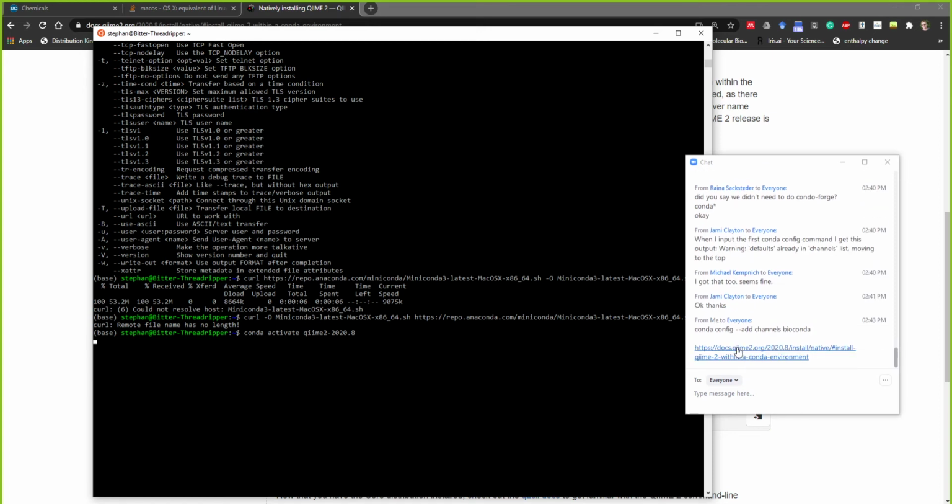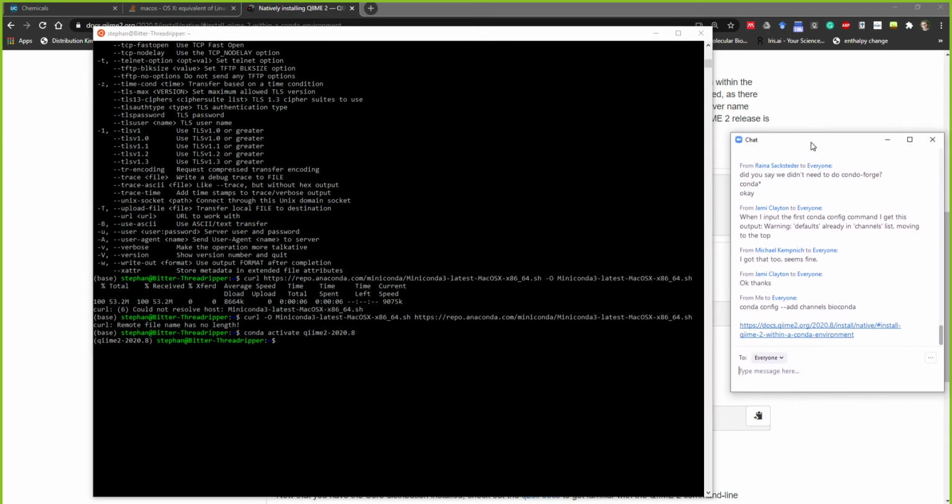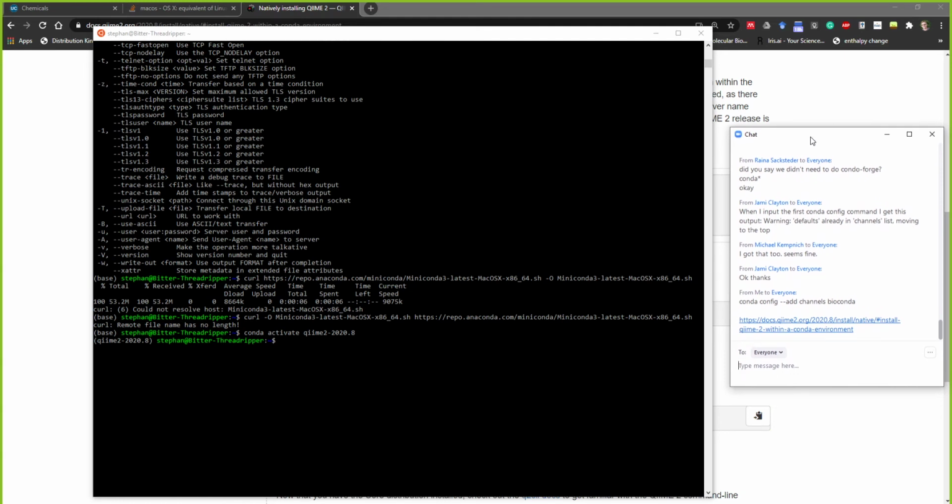Stefan, before we move on, let's ask the undergrads in our lab and see if they were able to install QIIME. Can you please speak up? Lauren? Yeah, I got part of it done.